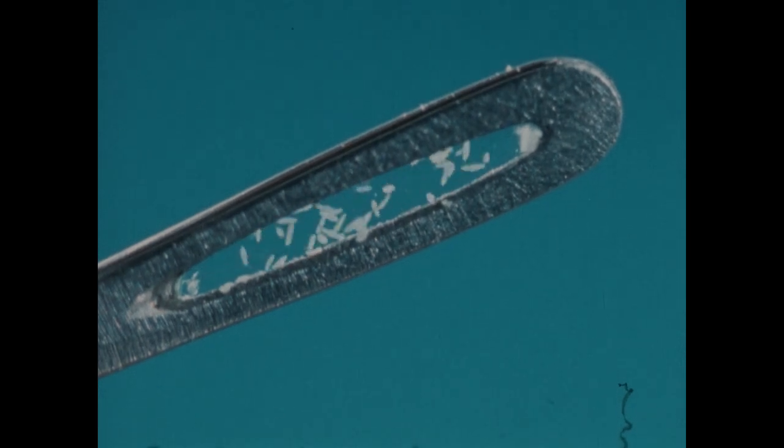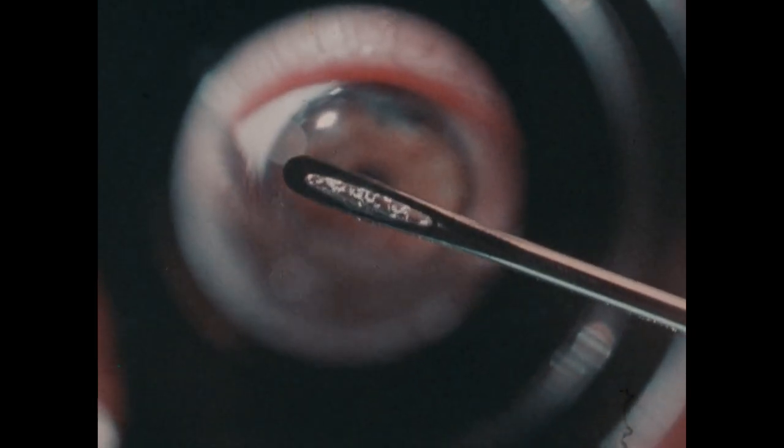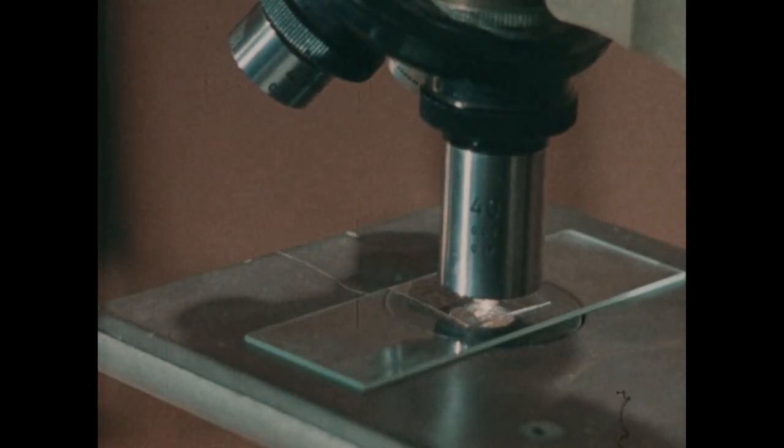At 1/4 of a millimeter, paramecium is about the smallest microorganism visible to the naked eye. Using a 40x objective and 10x eyepiece, paramecium appears enlarged 400 times. With a 100x objective and a 10x eyepiece, for a total magnification of 1000, you can only see the pointed end of the paramecium, covered by waving cilia, and nearby, some rod-shaped bacteria.